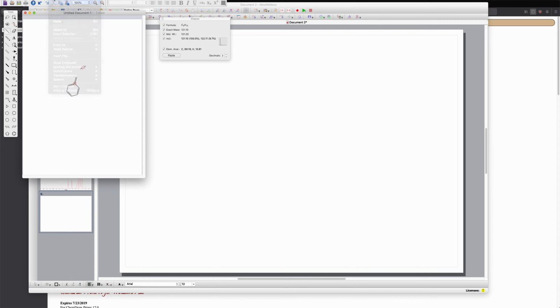Whoops. Let's see if I draw out something weird here. And let's just leave it like that. Come on, get rid of it. Let's see, what if we try this? There we go.